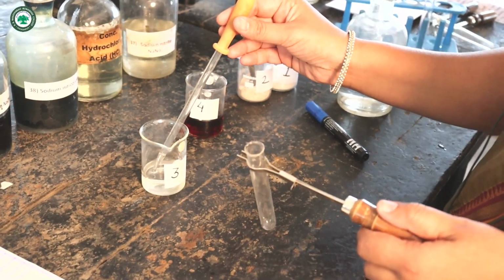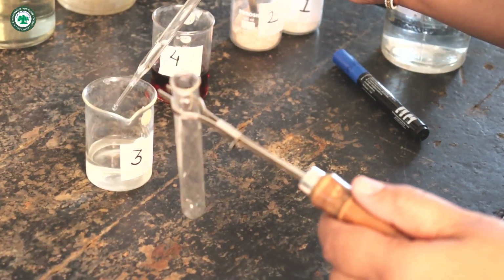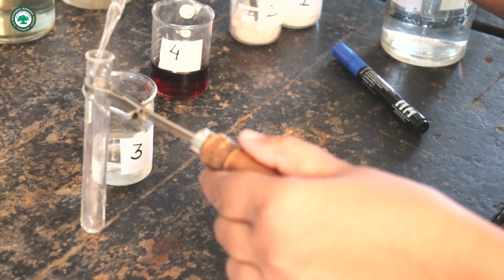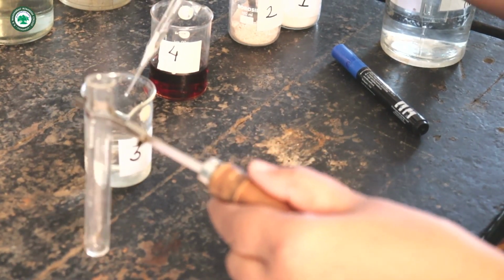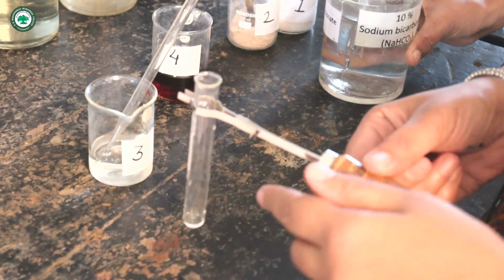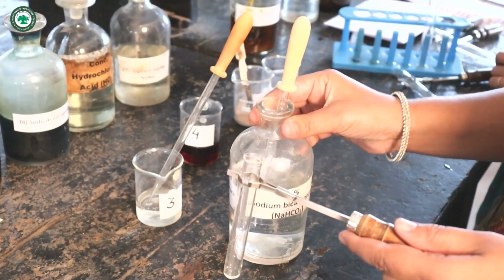Our third organic compound is in liquid state. Take 1 to 2 ml compound third. Then add 10% sodium bicarbonate.